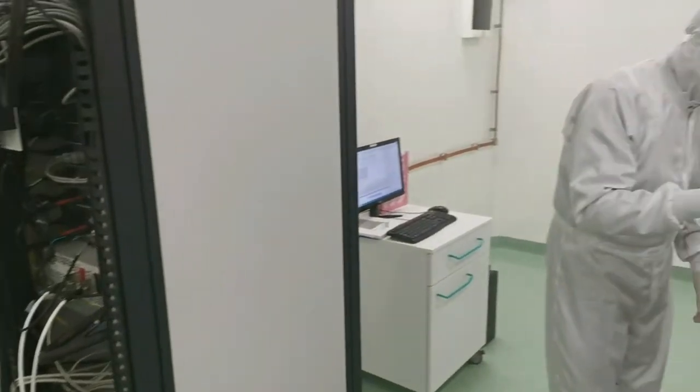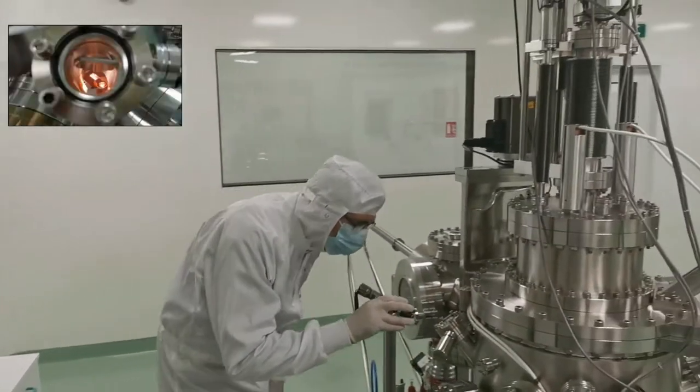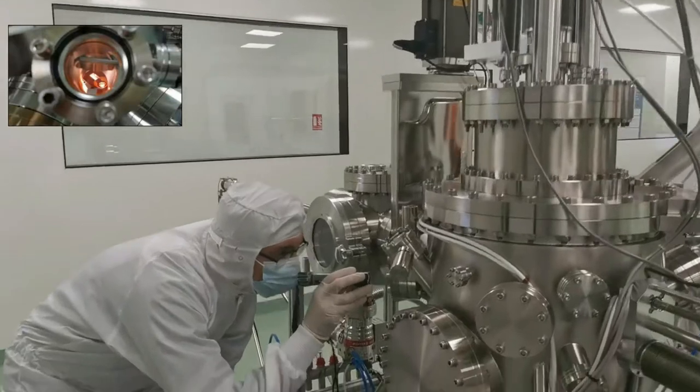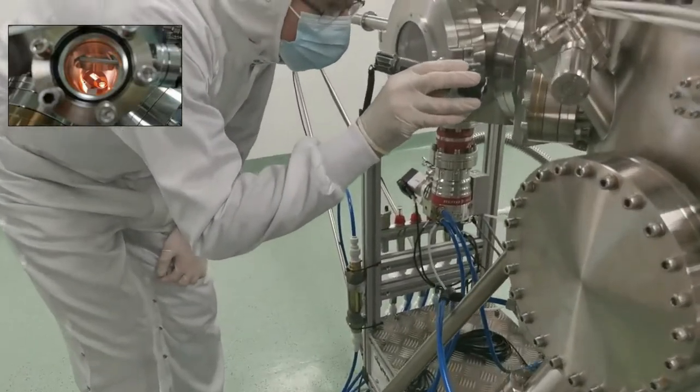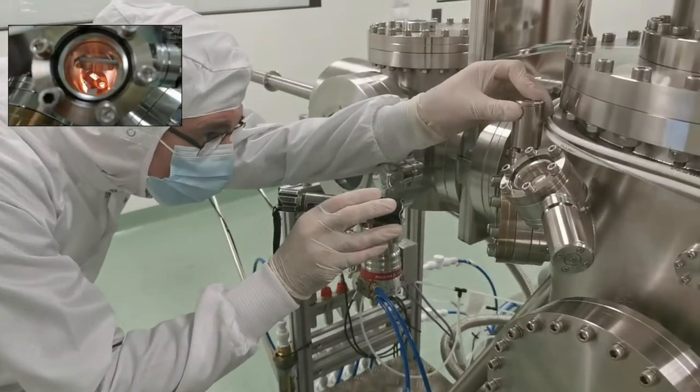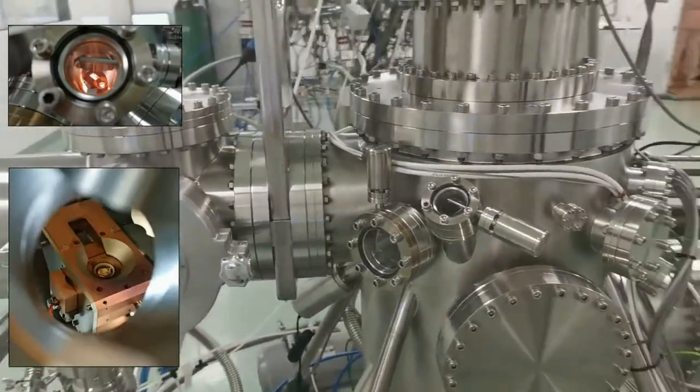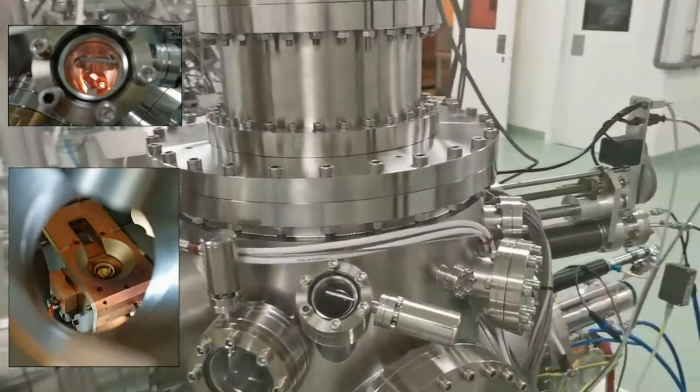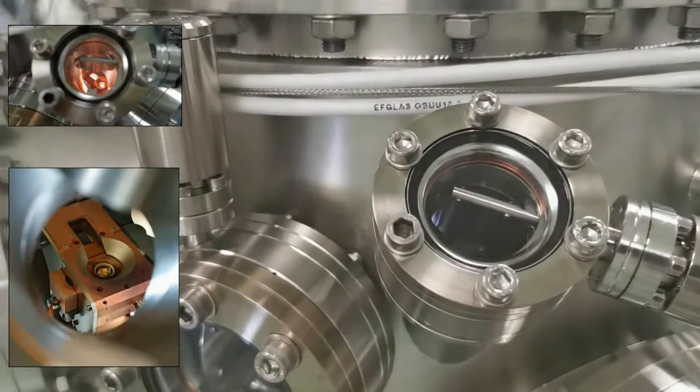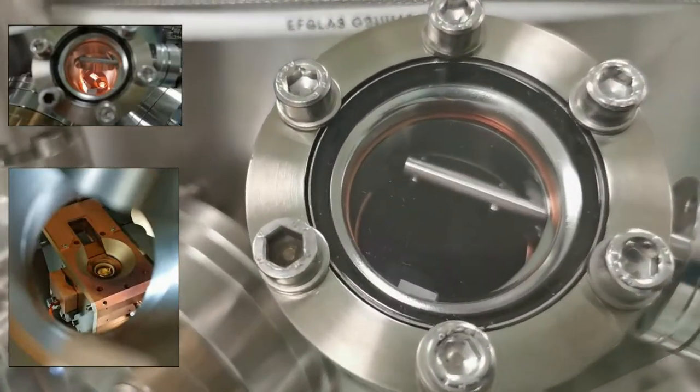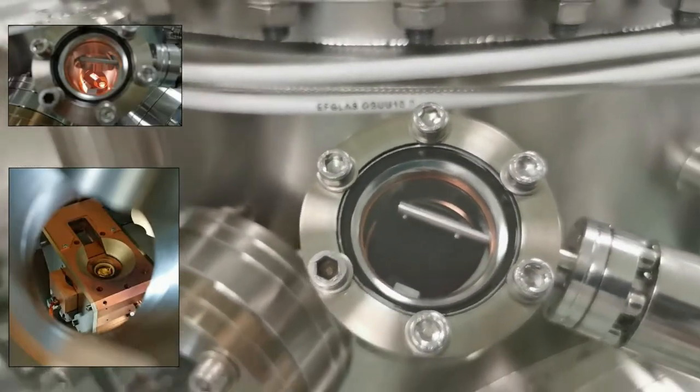The second ultra-high vacuum fabrication system is used for yielding thin and ultra-thin metallic films using E-beam deposition. This system features a multi-pocket source up to 6 different materials, a 10 to the minus 9 millibar base pressure, an up to 850 degrees Celsius deposition temperature, and rotating sample stage for homogeneous deposition.